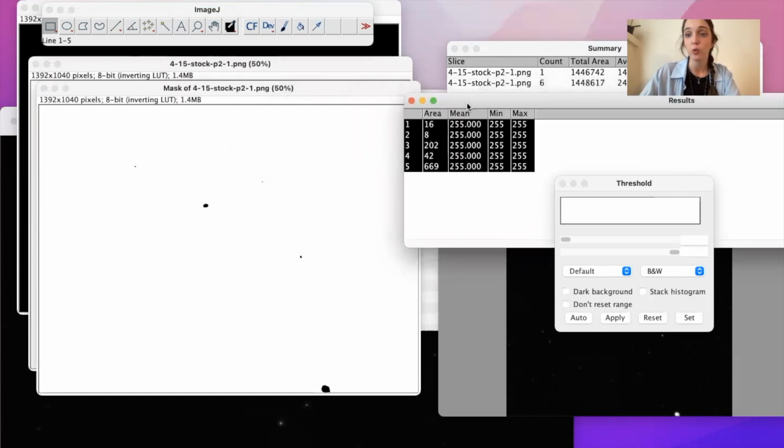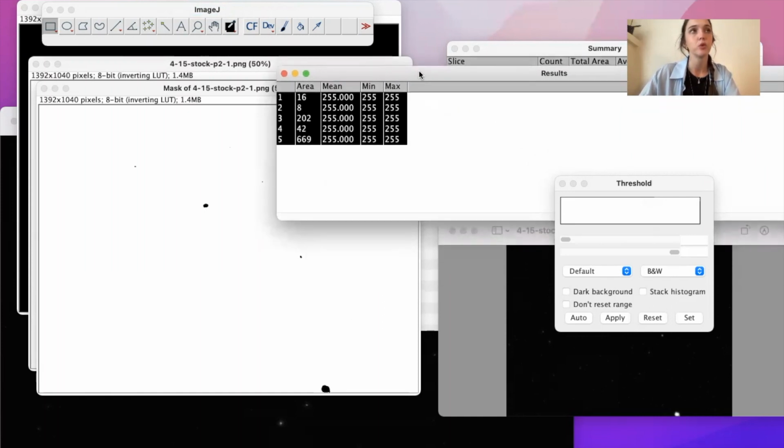Or if you can get the data just from this, then you're set to go. And that is how we find fluorescent particles from microscope images without having to individually count every single one, or without having to guess the size. It's fine if you just have a couple particles like in this photo, but once you start having a large concentration of fluorescent particles, love this analyze particles function. It's amazing. And it could also work for cell counting, so many other applications as well. If you take a picture of the actual sky, I bet that would work too. Ooh, let's do that.